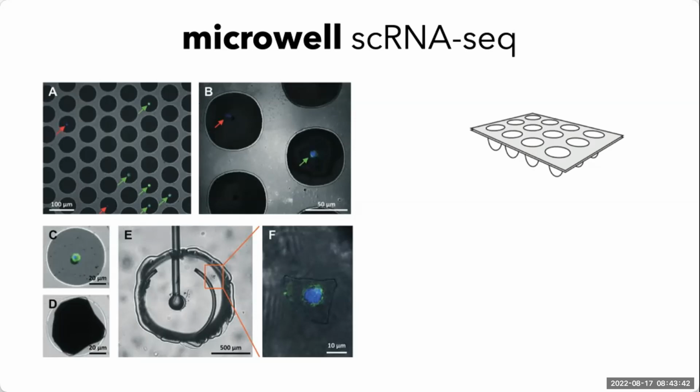So some of the drawbacks of this method is that they are often low throughput, and the amount of work required per cell may be really considerable, and it is not worth doing such an analysis for a large number of samples. So if you have very few samples and you want to perform this analysis, that can be extremely useful. But when you have hundreds and hundreds of cells in your tissues or in your samples, then it might not be worth performing this analysis using manual labor or using any other form.